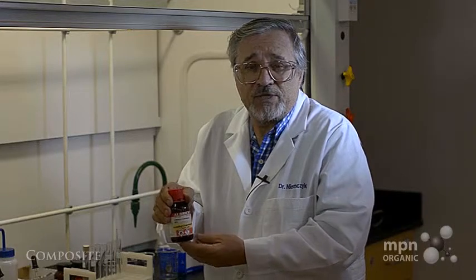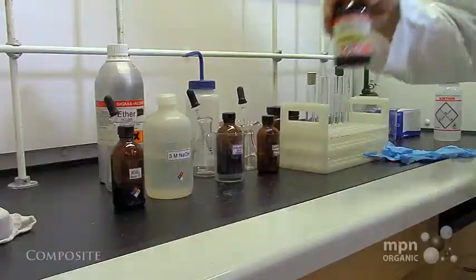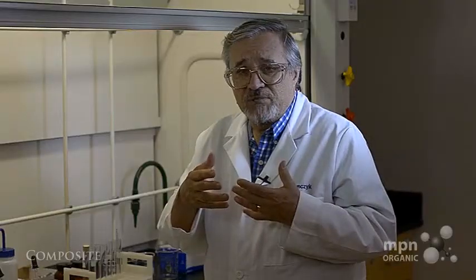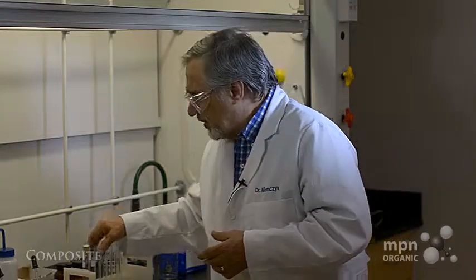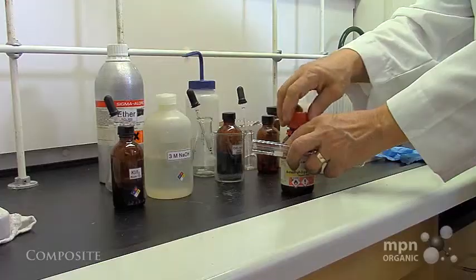And I've demonstrated that with acetone. But will it work with this? This is a methyl ketone. So I thought that I would show you that, in fact, this indeed is possible to do. So what I'm going to do, first of all, is to oxidize this with chromic acid.